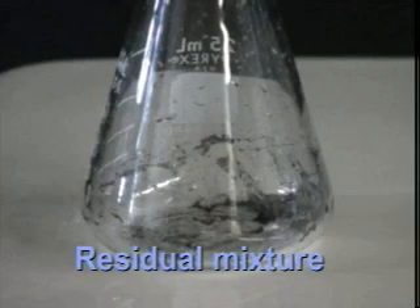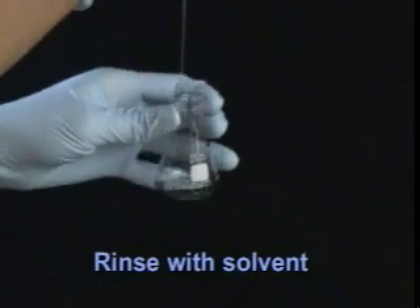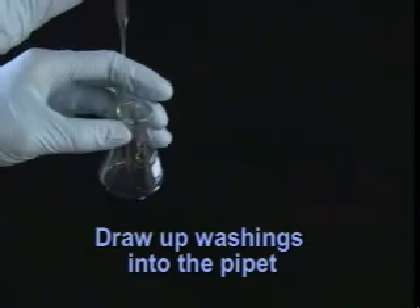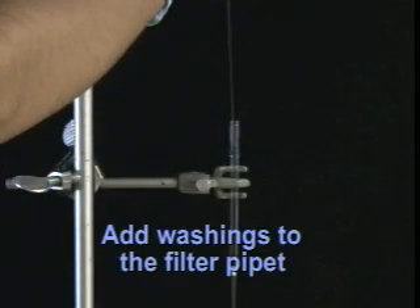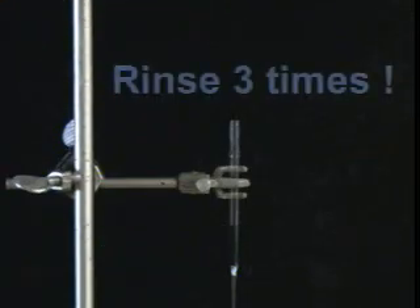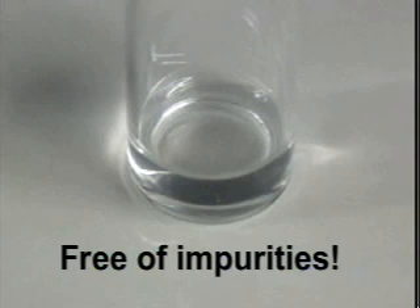Let's get back on track and take care of rinsing. There's residual mixture left in the flask. Rinse the flask with solvent, allowing it to run down the sides and collect any residual mixture. Draw up these washings into the pipette and transfer them, adding the washings to the filter pipette and allowing them to be filtered. You need to rinse the flask and add its washings a total of three times. When the filtration's all done, we'll have the filtered product — free of impurities.